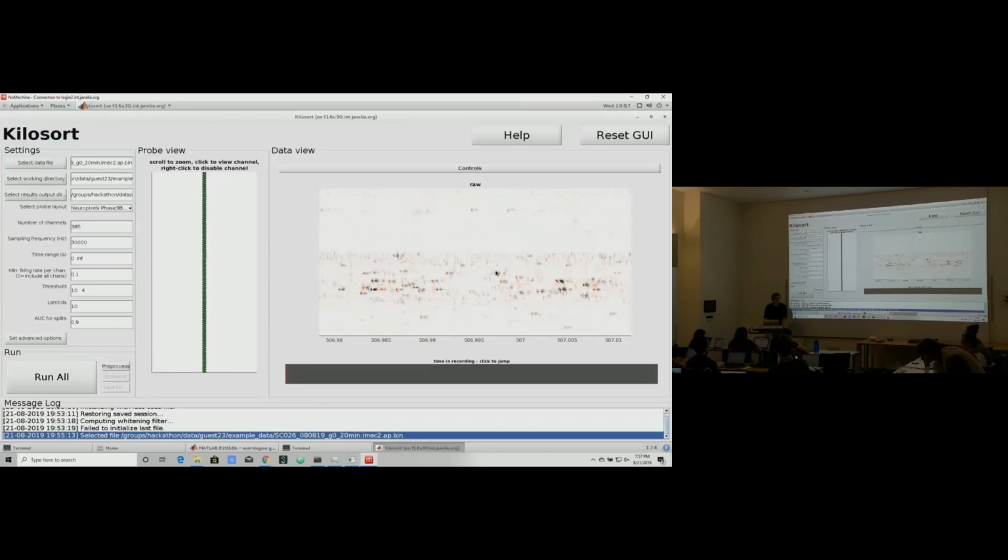There's one more mouse for whoever gets there first, but I'm just kidding. But it's easier with a mouse, of course. So press Shift and zoom in.